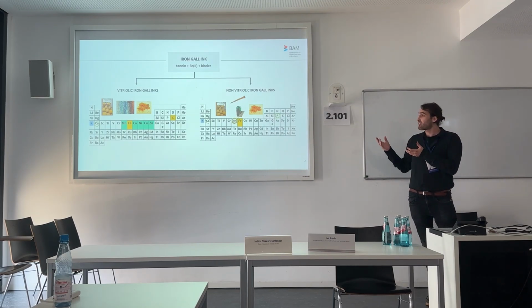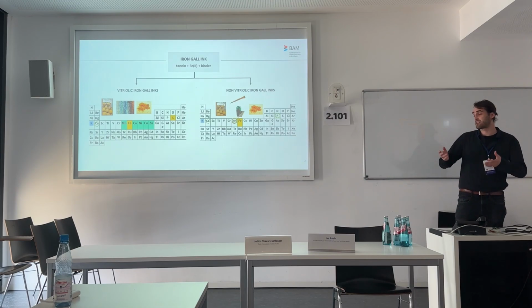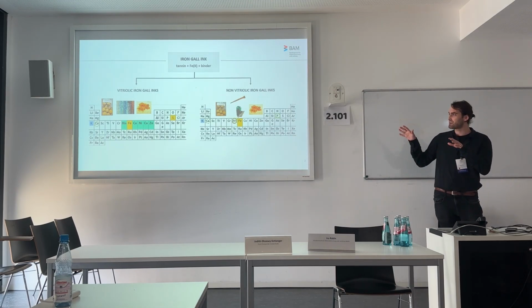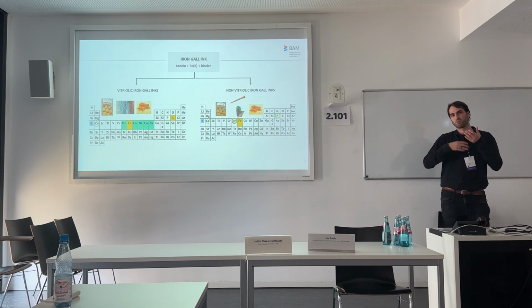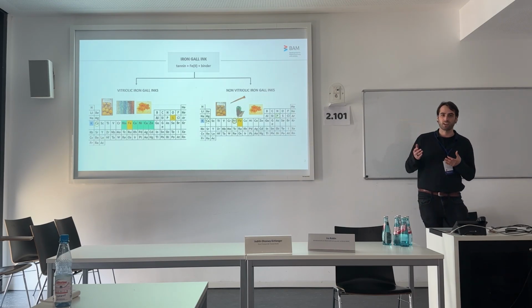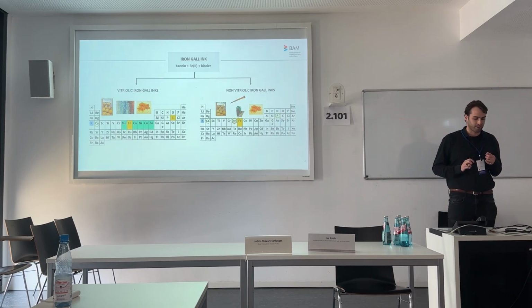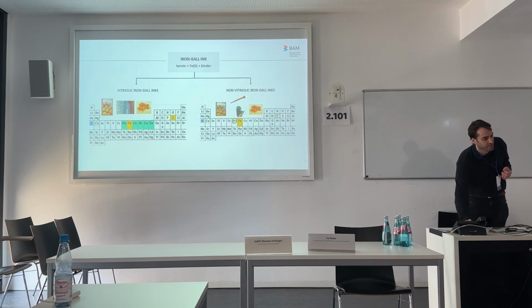They can contain phosphorus if another salt was used for the production of ink, and potassium from the binder or the tannins. I'll speak about tannins a bit further on in my presentation, but the sources of tannins were not always gallnuts. And now, with the addition of another tool to our protocol, which Professor Rabin already mentioned, we can say a little bit more about the organic part of the inks.